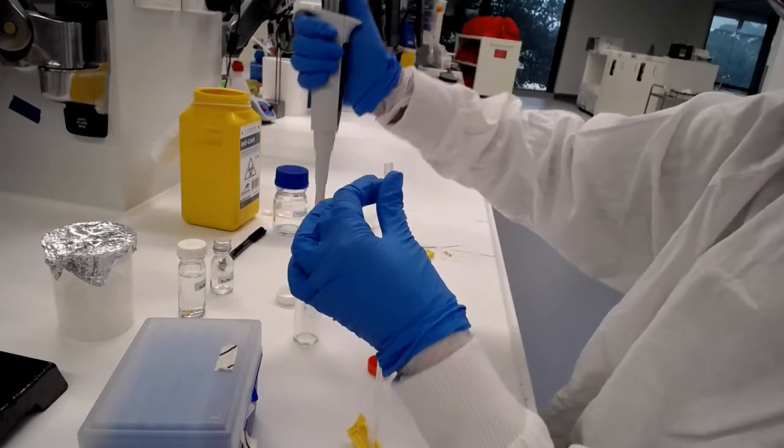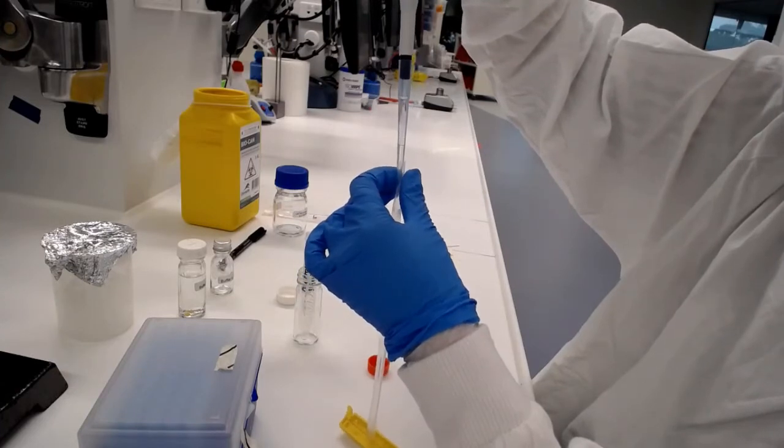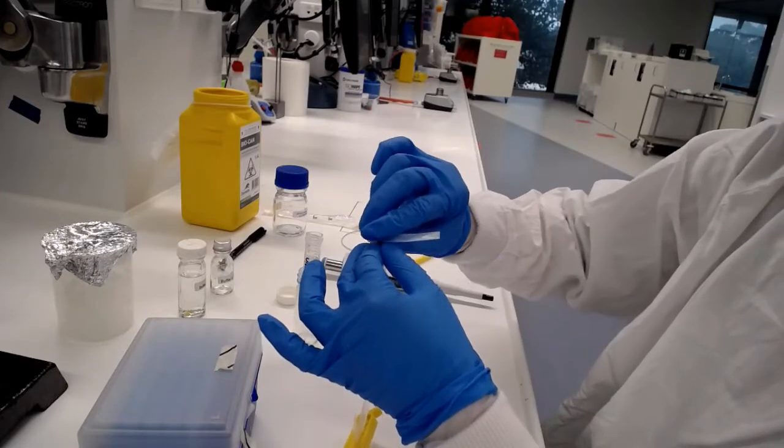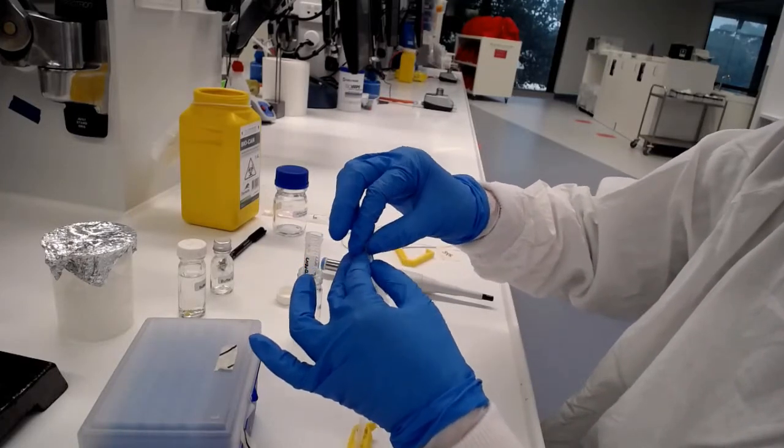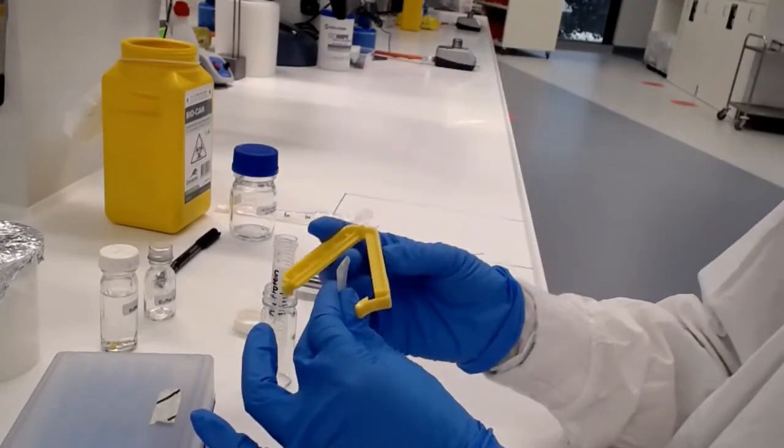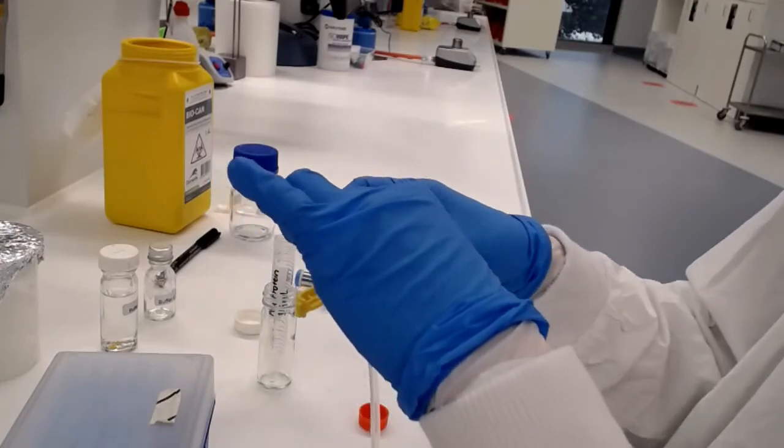That solution should be gradually falling down into the bottom of the dialysis tubing as we load more and more of it into the top. It's very important to clip the bottom first before adding our protein. Once we've squeezed out the air bubbles, we're going to then double over the other end of the tubing and clip it tight with the second dialysis clip. Now that tubing is tightly closed.